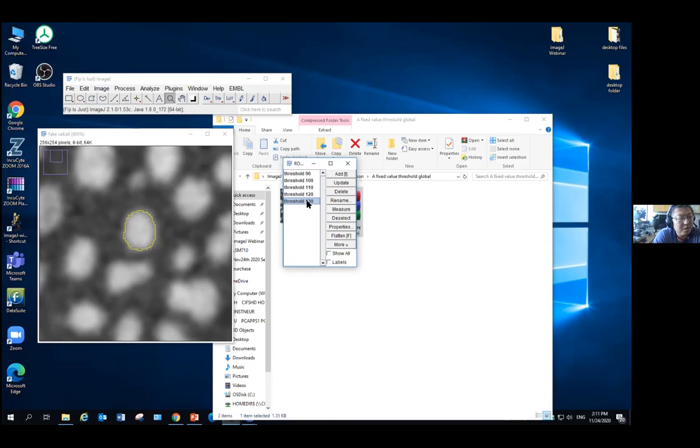What I mean by reasonable is that I can defend myself saying, this is the outline of my cell, I look at this image and I think that looks okay. Someone may think it's too small and should be more like this. Someone else may agree with me. It's not definitely wrong; it looks like a reasonable representation of this cell.